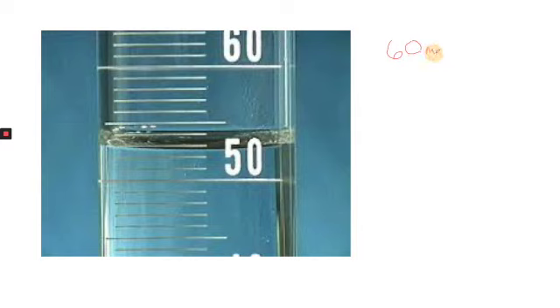I'm going to show my math here because I'm going to be a good math student. I'm also going to put my unit on my numbers, being a good science student. So 60 minus 50, the difference between those two numbers very easily is 10 milliliters.